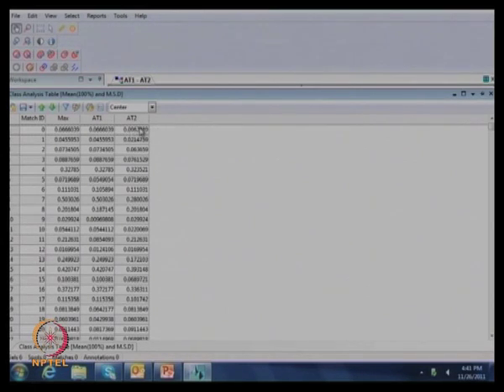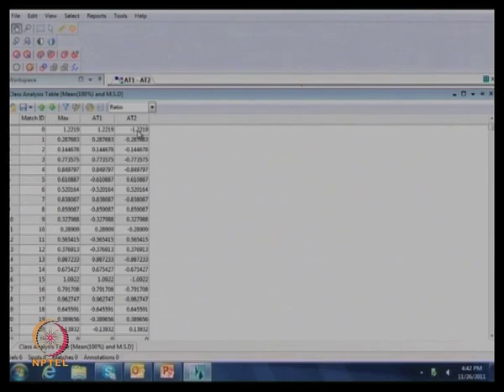Okay, so for the control and treatment, both groups we had 6 gels, right? Yes. So what are the values in each of the 6 gels for each spot? For each spot, exactly. This is the averaged value again, the average of all the 3 gels from each group. If you can see, this is the ratio value which is giving the upregulation or downregulation.